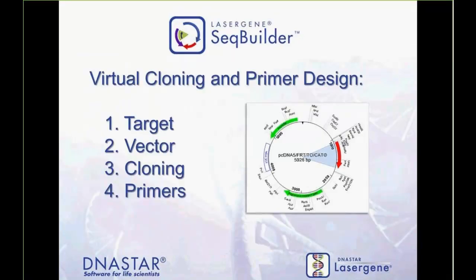Today we'll go over some of the following logical steps. Working with the target sequence, what things within the software can I do to make sure that my target is optimized for that specific expression that we're working with. Working with the vector sequence, looking at the multiple cloning site of that vector, making sure that the vector is in frame. Creating selectors of enzymes of interest that are specific for my multiple cloning site. Looking at traditional cloning, as well as some TA cloning, as well as some of the other in silico cloning wizards that we have, as well as creating the suitable primers to insert those restriction enzymes toward the end of your target to make sure that those clones will be successful.